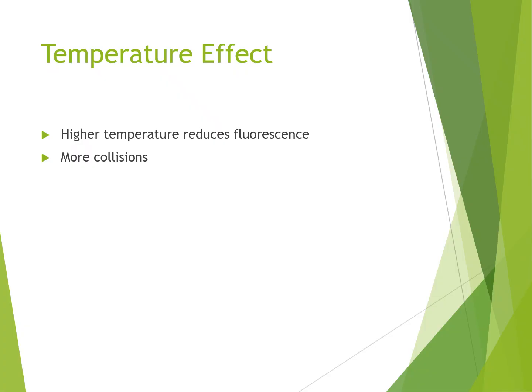Now we will learn about the temperature effect. Increasing temperature increases collisions and reduces the fluorescence intensity. If the temperature of the system is higher, then it reduces the fluorescence. As more collisions take place, the fluorescence intensity decreases.